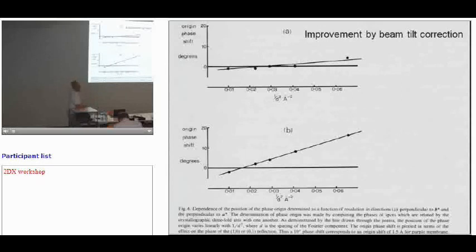They thought they could process cryomicroscope images of bacteriorhodopsin because they thought they knew what the amplitudes should be. So they assumed the images had a signal, but it was below the noise level, and they averaged them, and they published a paper called "Projection Structure of Bacteriorhodopsin at 3.5 angstroms" or so in EMBO in 1983. And it's all complete rubbish.